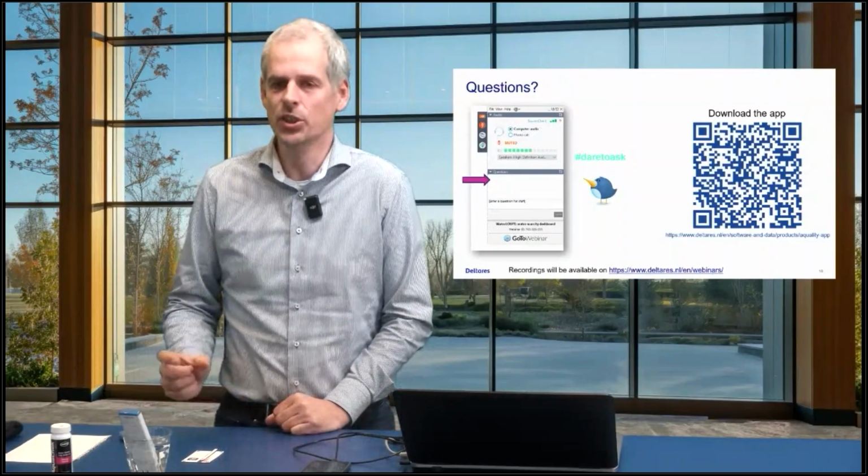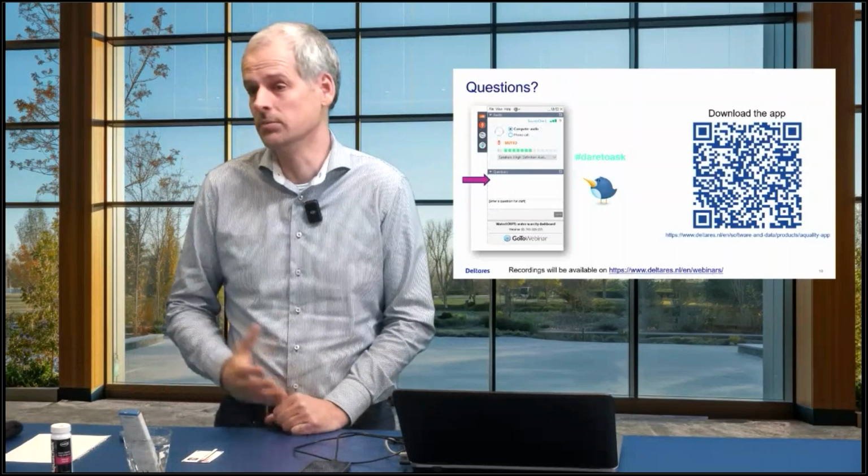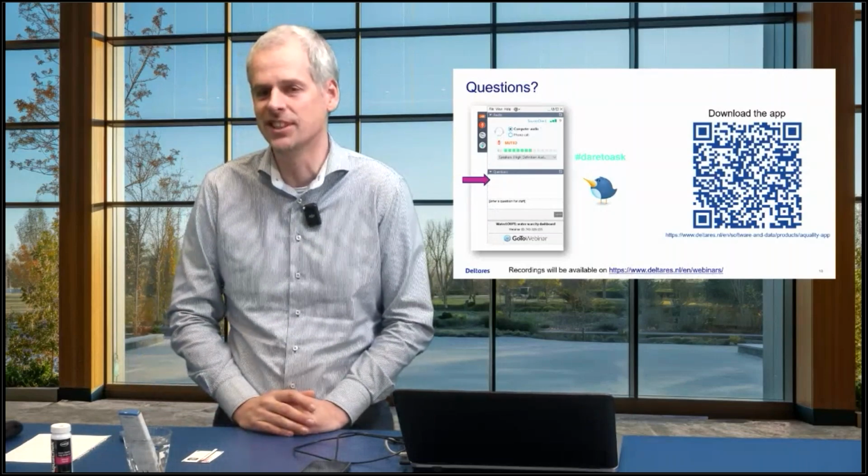You can even, there are some organizations who have a sort of live link via an API to take over the measurements instantly on their platform.